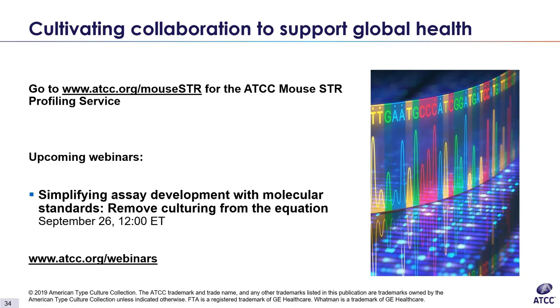No, absolutely not. We do not share any results, and they're only sent to the email address provided on the sample submission form. So the data produced is strictly confidential, and it's not used for any comparison to any samples from any of our customers. When a sample is submitted for testing, we only compare it to our ATCC reference profiles that were generated in-house.